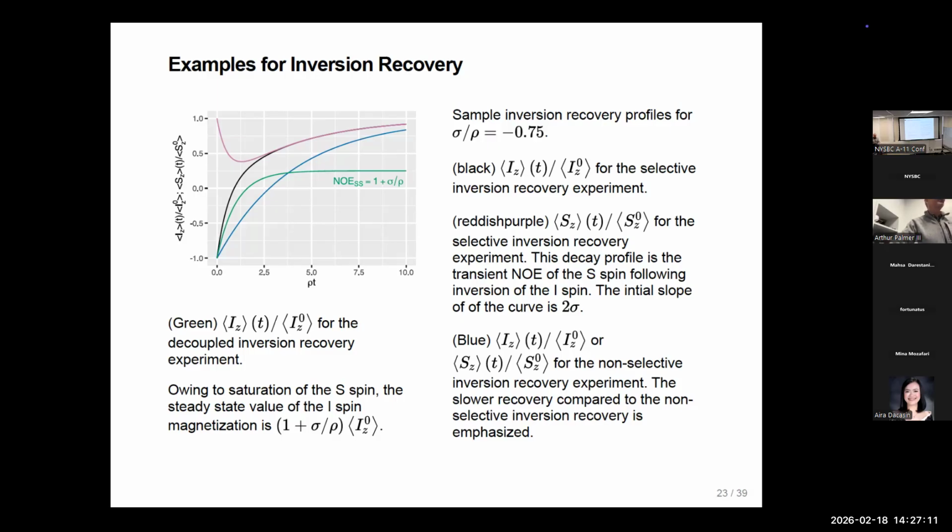So if we use deuterated glucose and really deuterate everything, then if we saturate the amide hydrogens, say with even just a 90-degree pulse that equalizes the levels, the R1s might become extremely long, on the order of 8 or 10 seconds. Whereas normally we're used to recycling between free induction decays in 1 or 2 seconds.